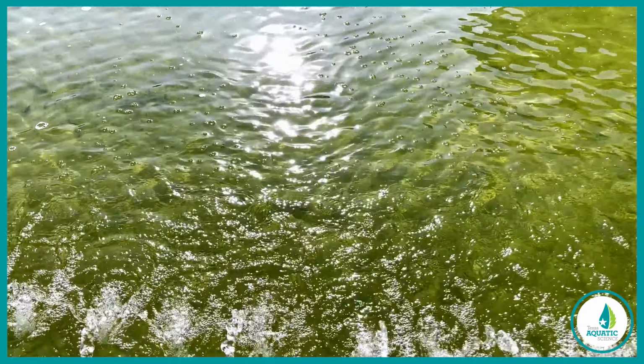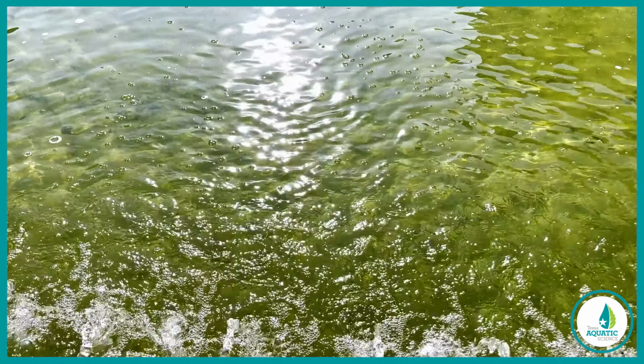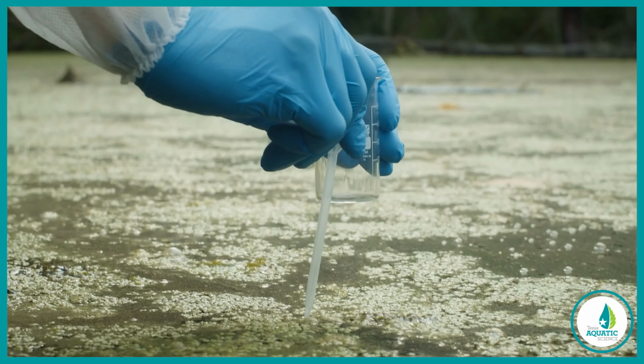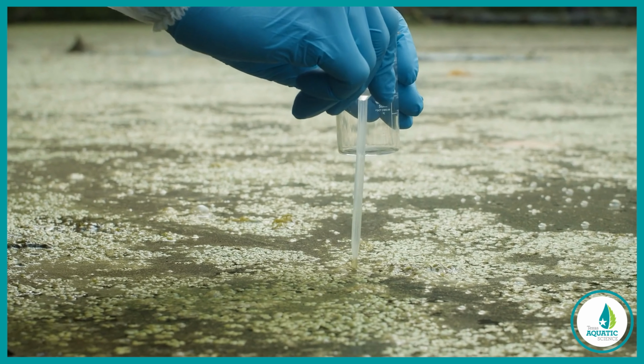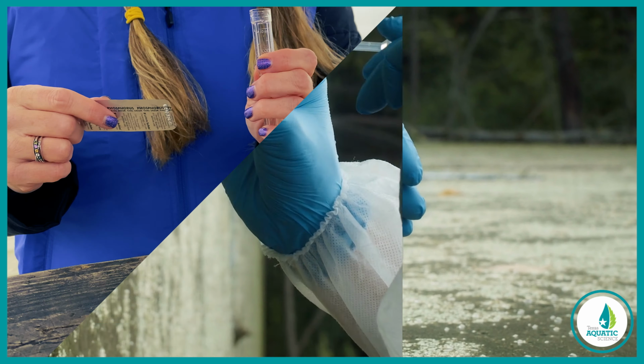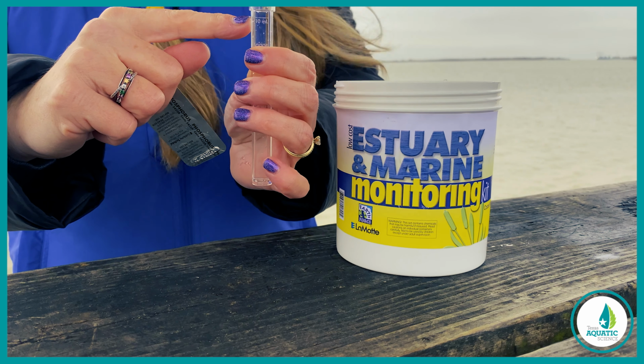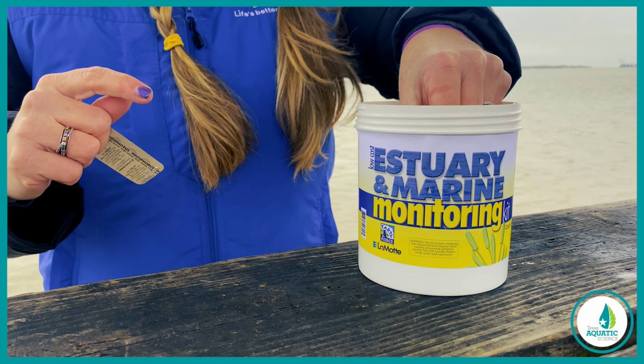You can find phosphates in detergents, cleaners, and fertilizers, which could end up in our surface water. Monitoring helps identify the potential environmental impact of contaminants, such as phosphate. Let's run a quick phosphate test on our sample from the Gulf Coast. Fill the test tube to the 10 milliliter line with the water sample.